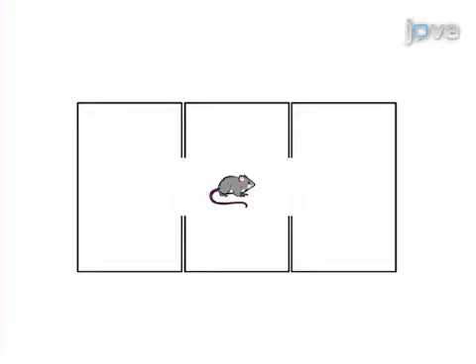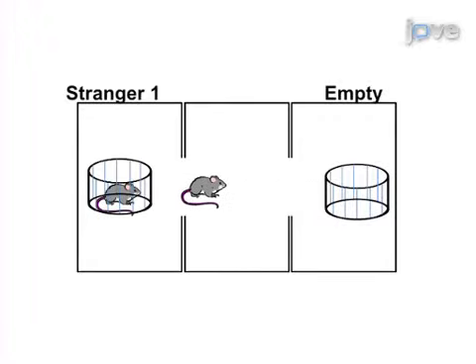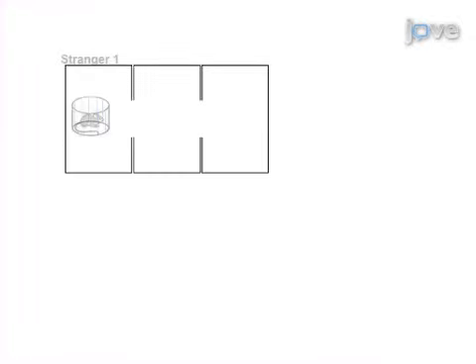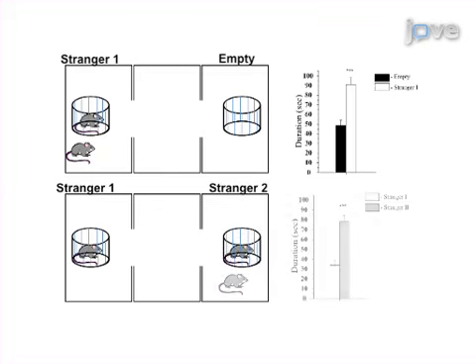After habituating to a central chamber, the experimental mouse is allowed to freely explore two other chambers, one with an empty cup and another containing an unfamiliar mouse. The next step allows the mouse a free choice between an already familiar animal and a newly introduced second mouse. Ultimately, results can be obtained that demonstrate differences in natural sociability and preference for social novelty in experimental versus control mice.